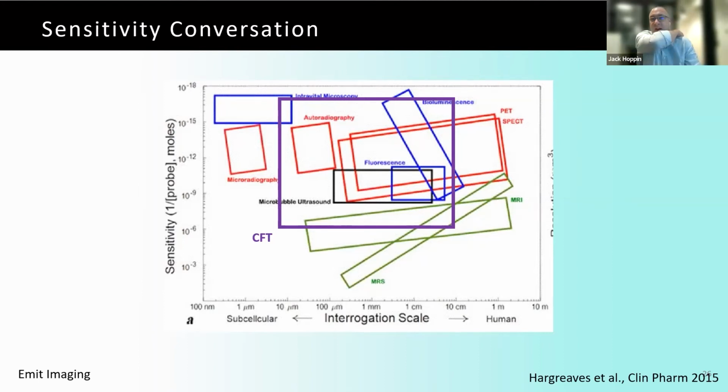In the case of DICOM data, it's a 12-bit data set. We're collecting on a 12-bit camera, taking many exposures and then mapping to a 32-bit system. So first off, from a computational perspective, we have a larger dynamic range by definition. We also have a larger dynamic range because I think we all know and have all experienced, if we have a very hot region of interest in any nuclear tomography modality, the bladder will blow out anything in plane in the imaging system.